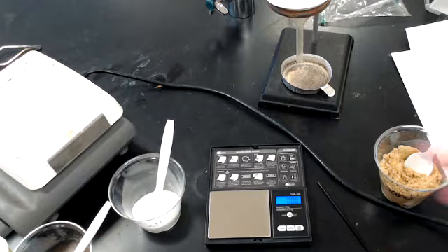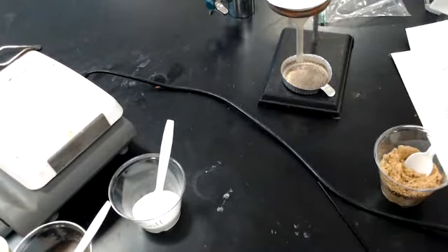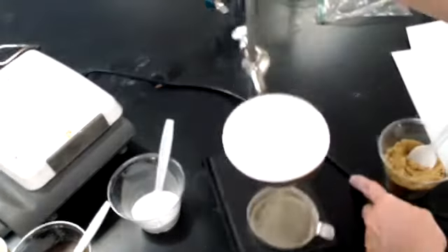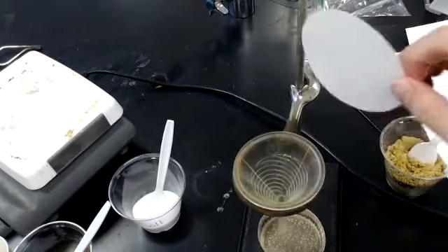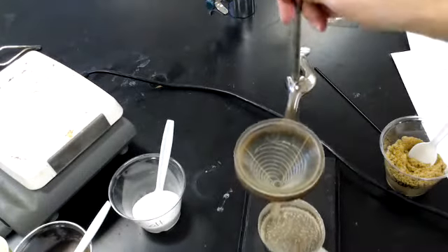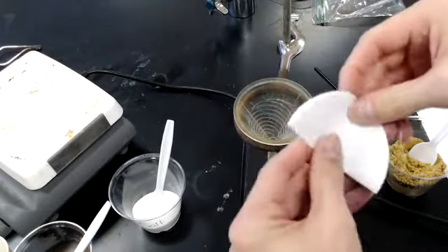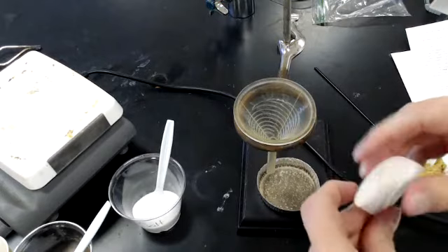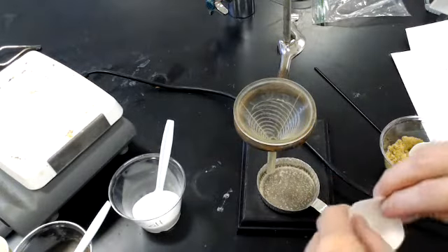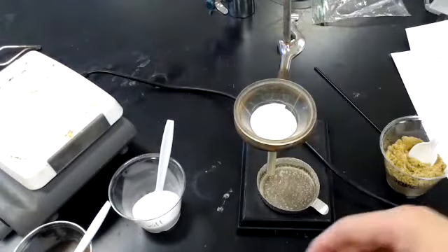Now we're going to keep separating the mixture. So I'll put my balance out of the way because now I'm going to be doing a different kind of separation here. So here I have filter paper and a funnel to put the filter paper into. I am folding my filter paper in half and in half. Okay. And now I've got my filter paper in my funnel and it's going to work.